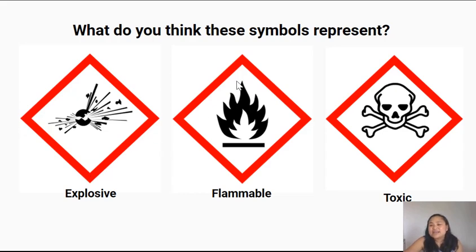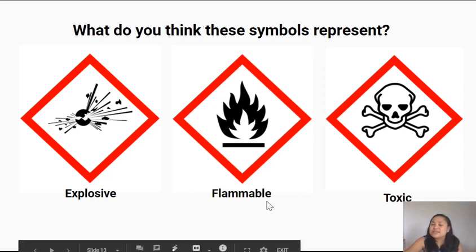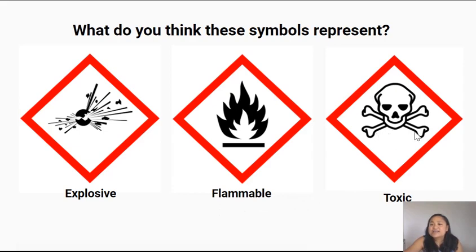This sign looks like fire flames — it represents that something is flammable, meaning it could catch on fire. In this symbol here you've got a skull and some bones. That looks like death. This symbol represents that something is toxic — it could harm you or even cause death.